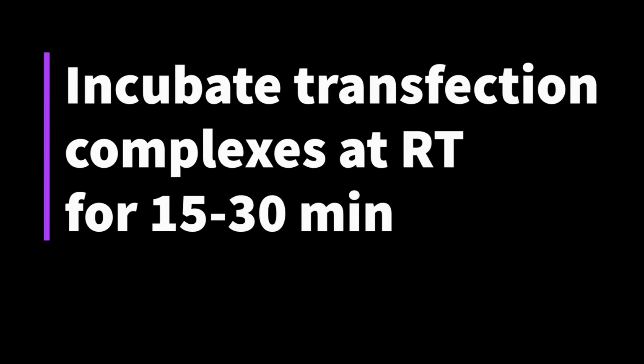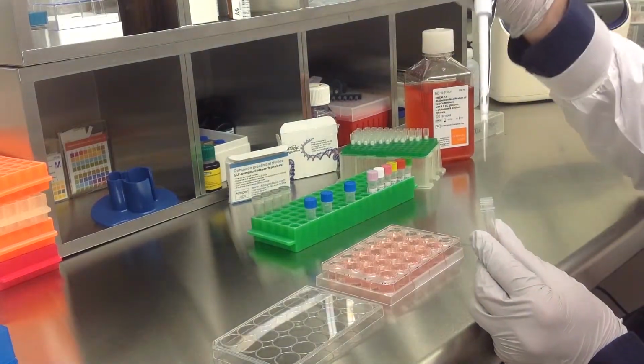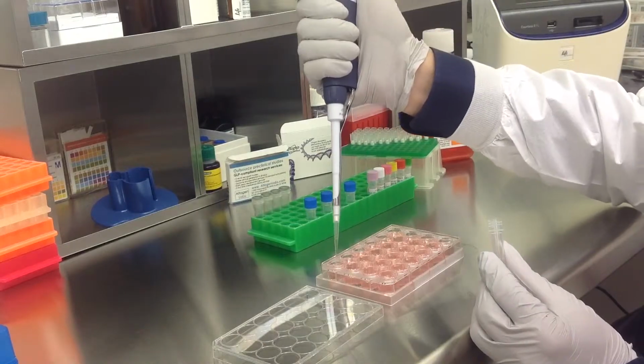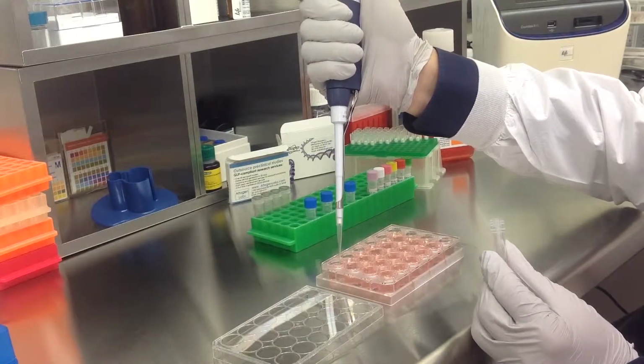Incubate the prepared transfection complexes at room temperature for 15 to 30 minutes. Add the prepared transfection complexes to the 500 microliters of complete growth medium.